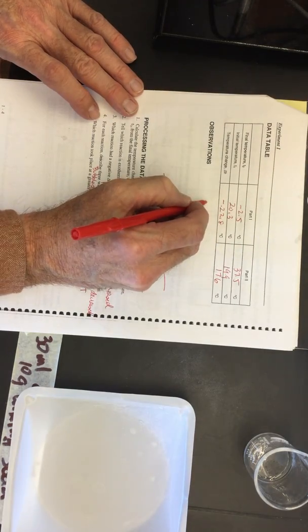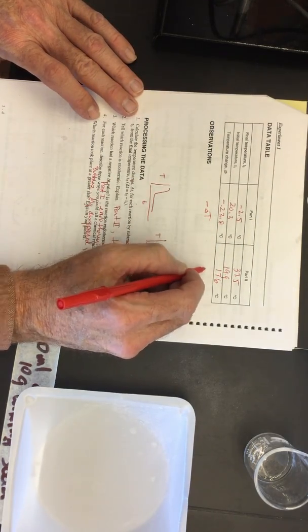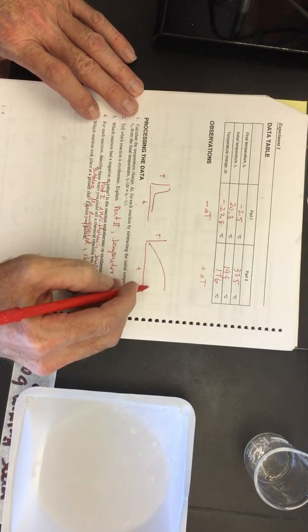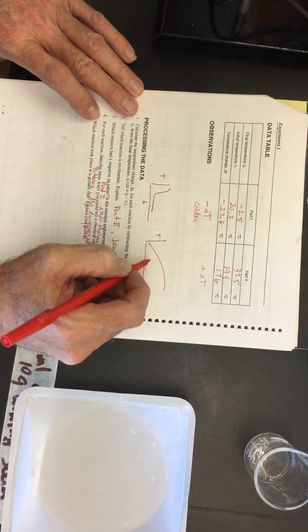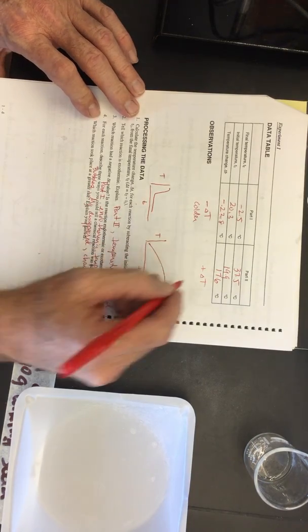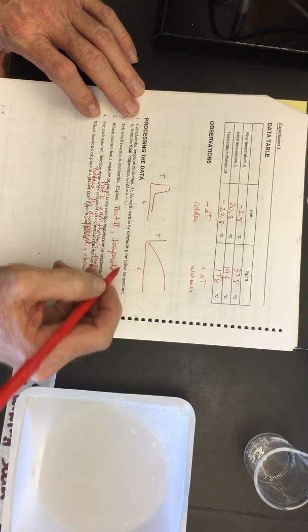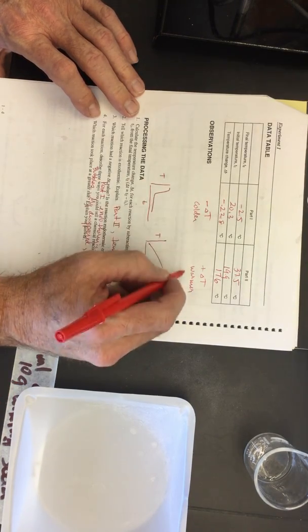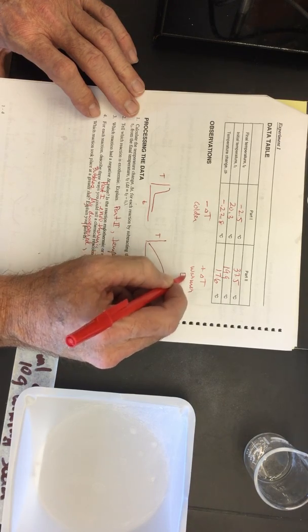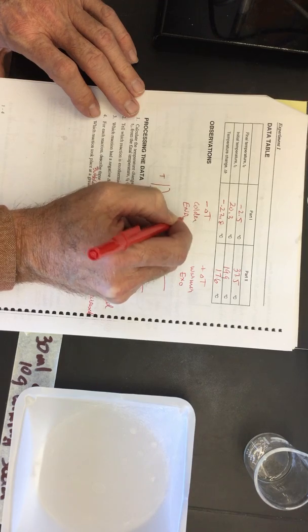So let's take a look at these. For part 1, we have a negative delta T. Part 2, we have a positive delta T. Negative delta T means it got colder. Positive delta T means that it got warmer. If it gets warmer, this is the easier one. It's an exothermic reaction. If it gets colder, it's an endothermic reaction.